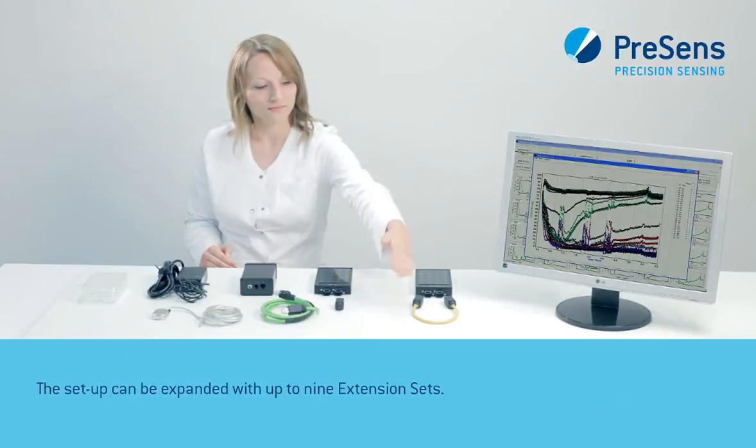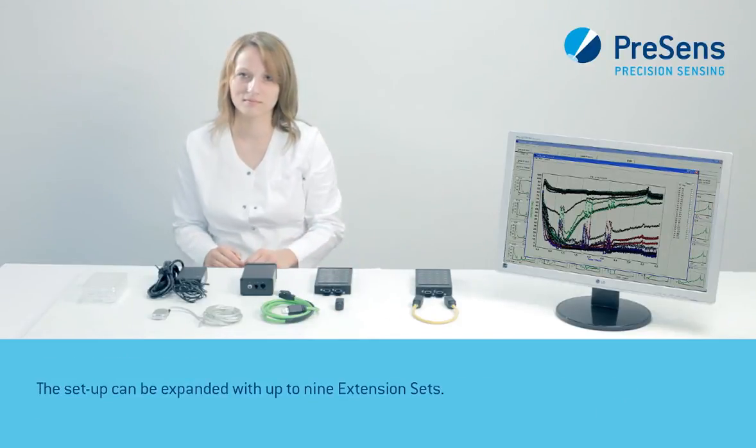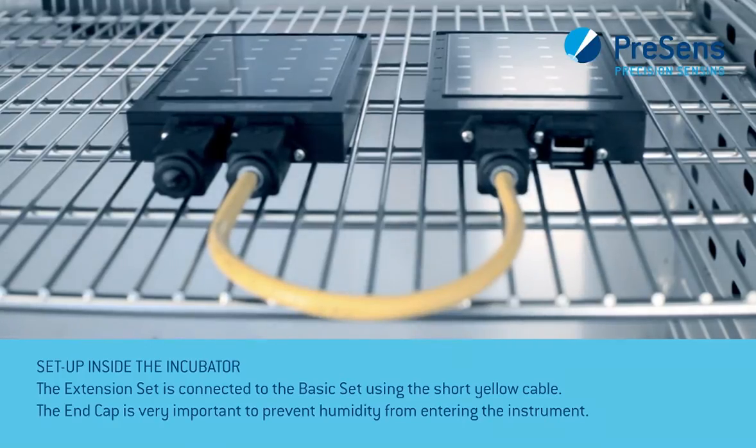The setup can be expanded with up to nine extension sets. The extension set is connected to the basic set using the short yellow cable. The end cap is very important to prevent humidity from entering the instrument.